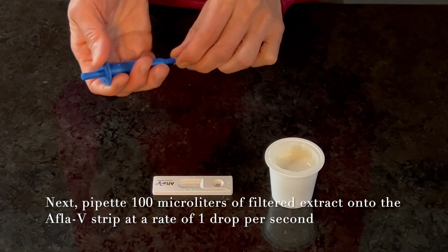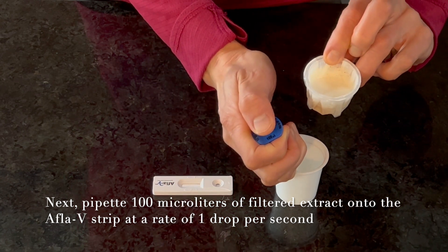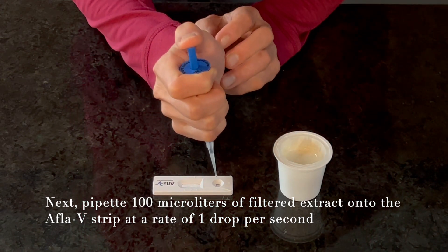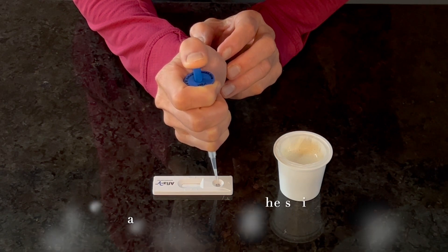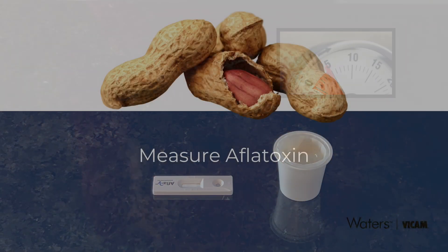Transfer 100 microliters of filtered sample extract to the APLA-V strip by pipetting vertically into the round sample opening, allowing the sample to flow at a rate of about 1 drop per second. Be sure to transfer all of the sample from the pipette tip to the strip. Set a timer for 5 minutes, allowing the strip to develop on a flat surface.